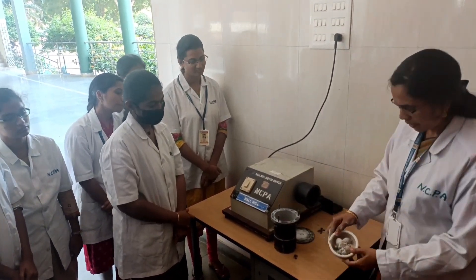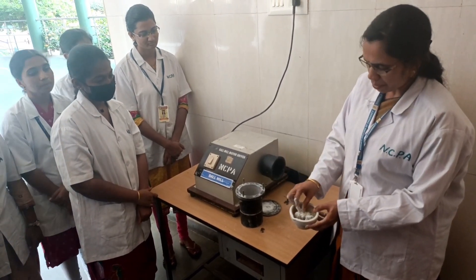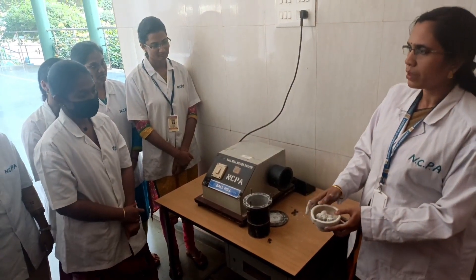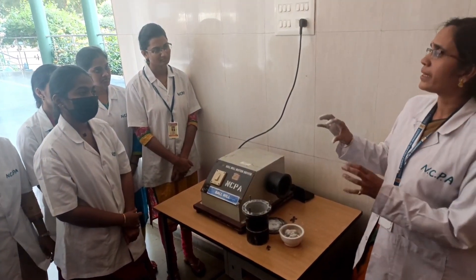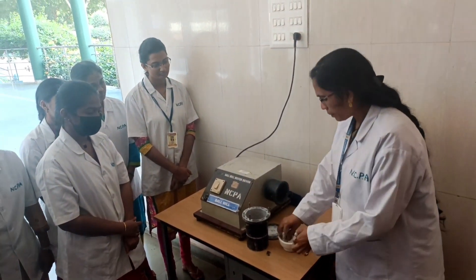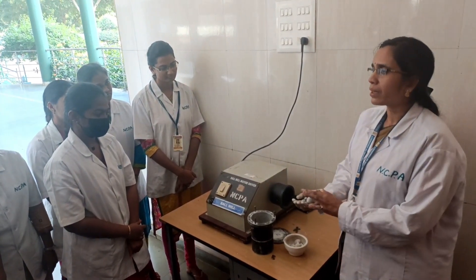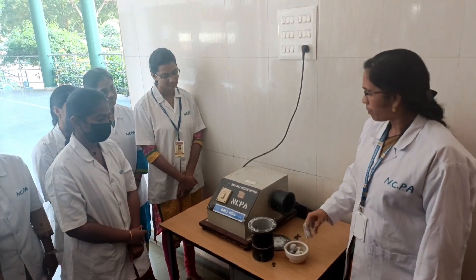See, the size will be reduced to very fine size. Because we are using very less time, only some of the bulk material is converted into fine size. We have to maintain the time depending upon the size that you want, and the balls or pebbles that we are going to use also have an impact on the size of the particles. This is how Ball Mill works.